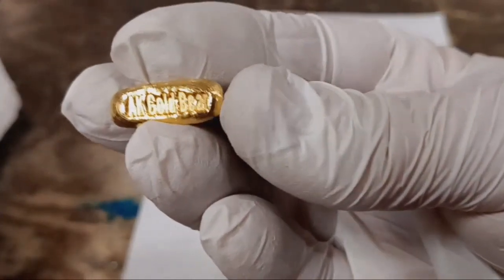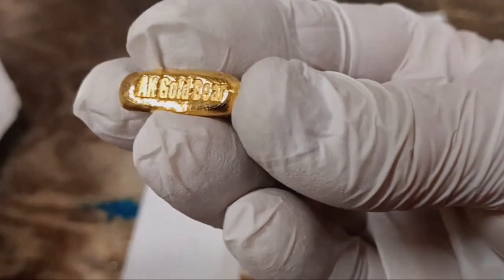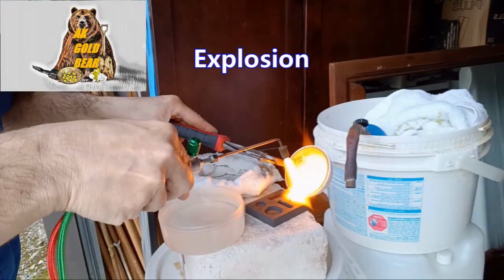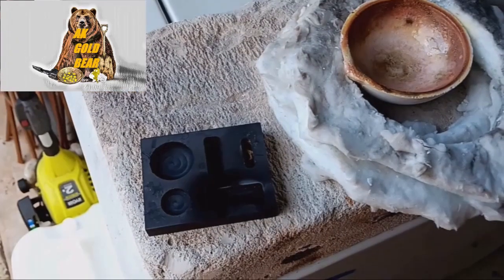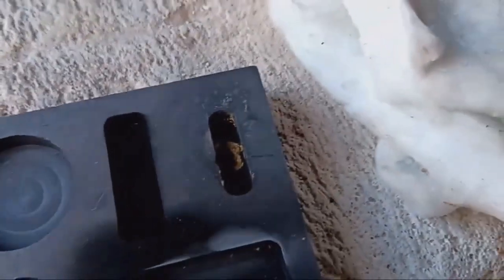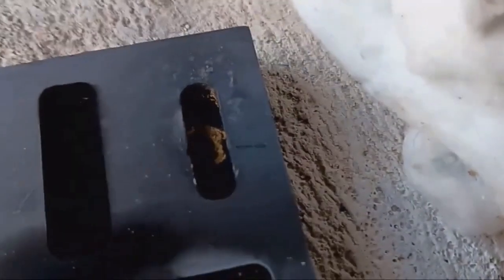I need a new camera. Last time when I melted gold and poured it into the graphite mold, there was some explosion and I lost some gold, plus some gold was stuck inside the mold. This time I got everything.